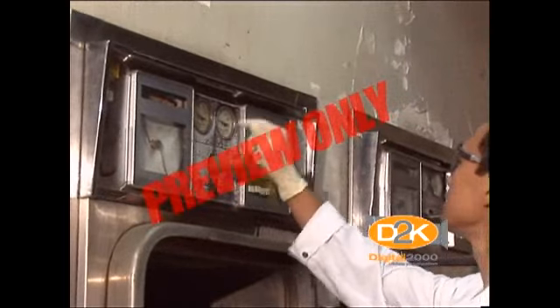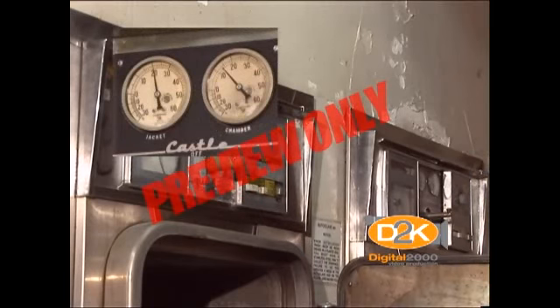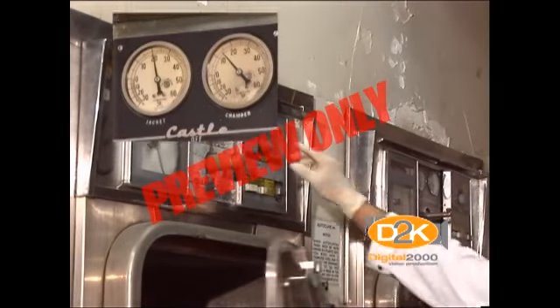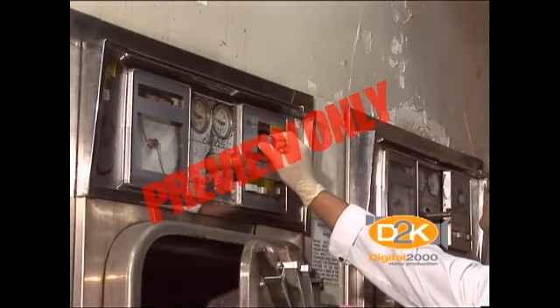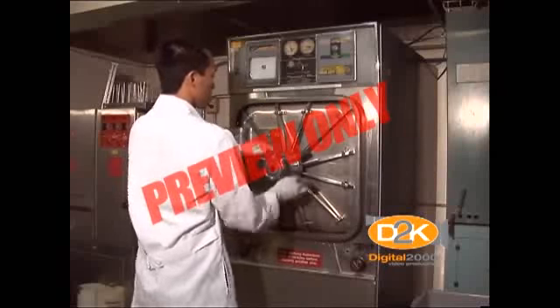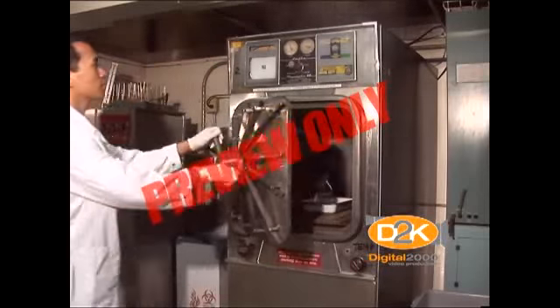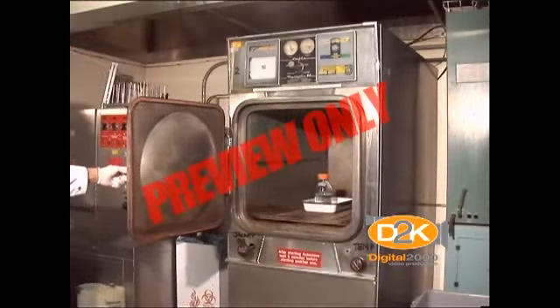Autoclaves use high temperature, 121 degrees Celsius, and pressure, at least 15 pounds of pressure, to sterilize and inactivate biological material. The time and setting of the autoclave cycle is dependent upon the material. Follow the instruction of your supervisor for the best method.